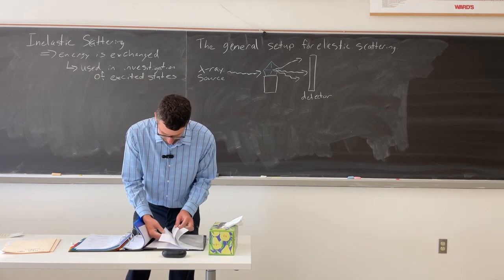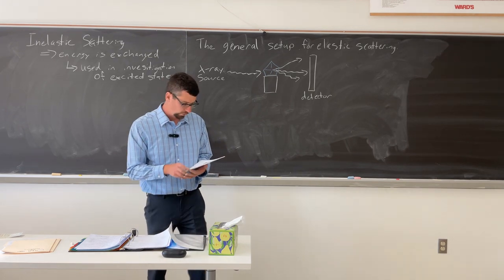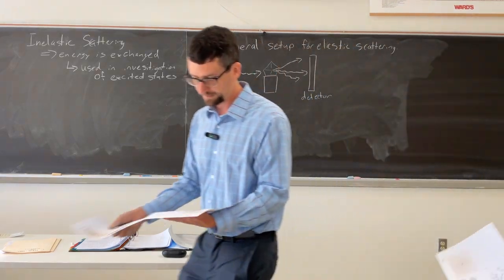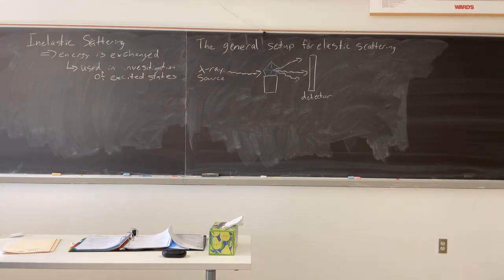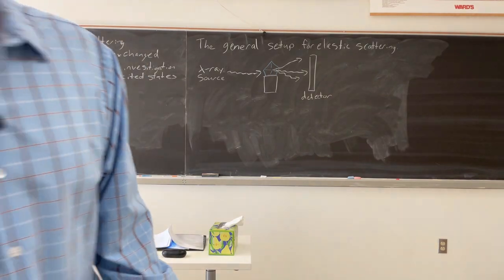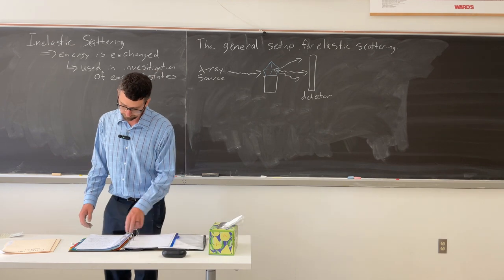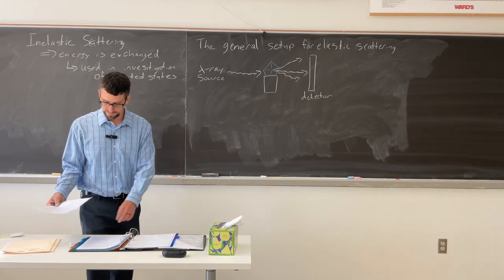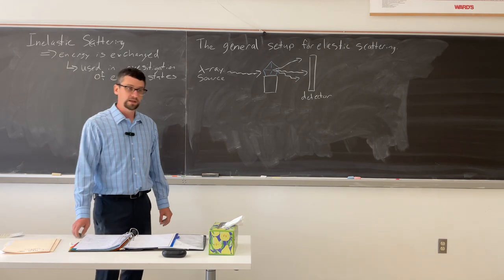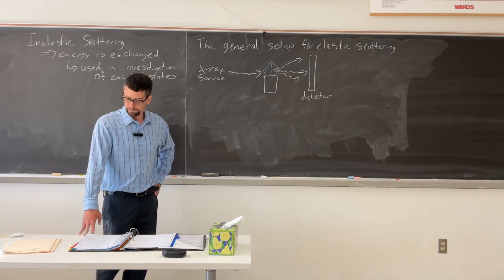I will pass this out, which you're going to need in a little bit, but it shows the workflow. One of them in the corner, labeled figure 5, is actually a single crystal diffraction pattern. And that is on a piece of film. I can't remember which scientist it was. I had it written down in here. It was related to the Braggs. They might have even been the Braggs that took that picture.